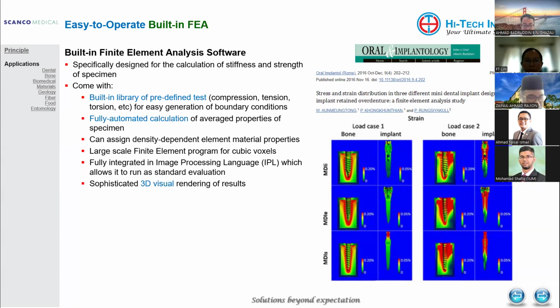So you have an in-house FEA analysis inside the software. With regards to changes of pre and post, I mean when you want to see pre-treatment, and then after that you see what happened after you put something, post. You have two images, new and old, to see bone trabeculae or bone geometry or the Haversian systems, all these things. Can the data be compared from your data acquisition, both pre and post, inside your software?